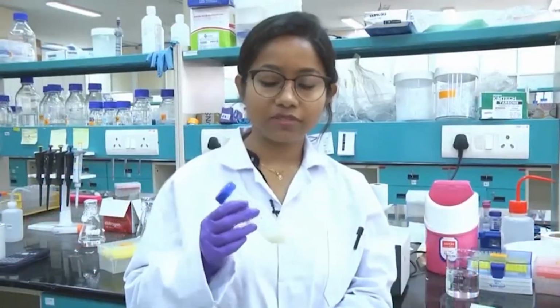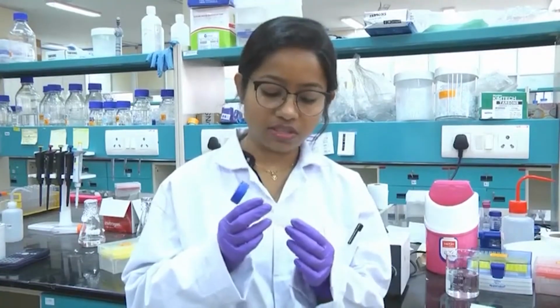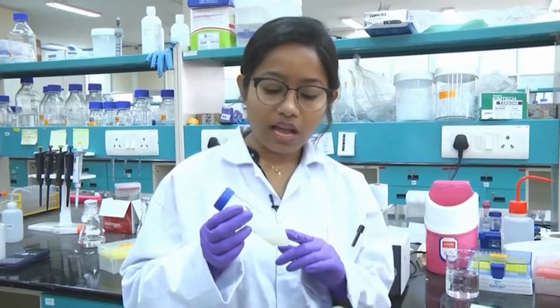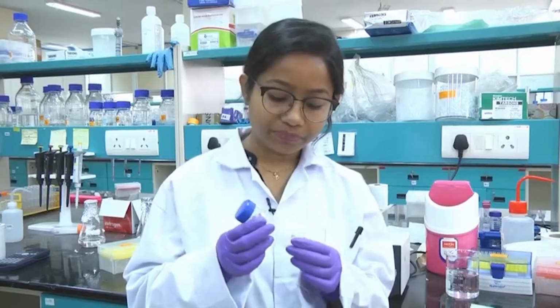Along with the pH, we have Tris to confirm the pH. As I mentioned, your buffer should have a particular pH. In our case we use Tris to regulate the pH of this solution, because Tris has a basic pH value, so the pH is 8.2. Along with the Tris, it has some NaCl salt. The salt is important for a particular protein, because if the salt is too low or too high, the protein might get precipitated out. So you need to have a proper buffer system. In our case the salt concentration is around 200 millimolar NaCl.